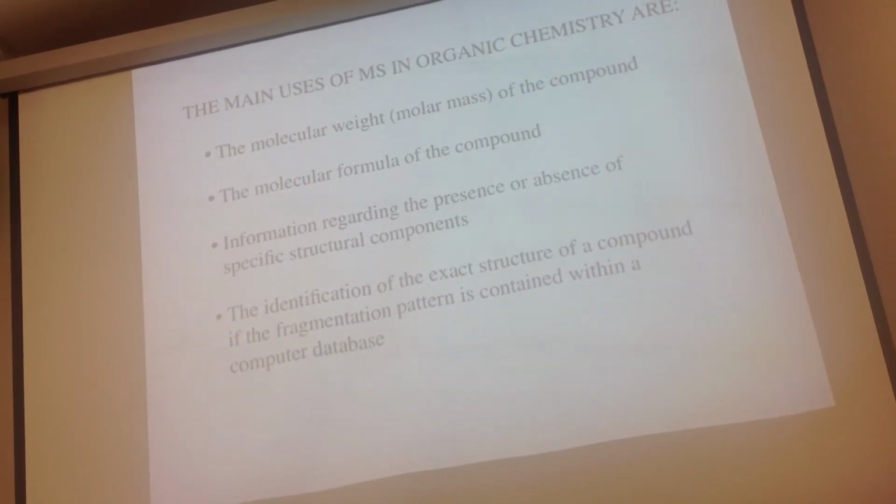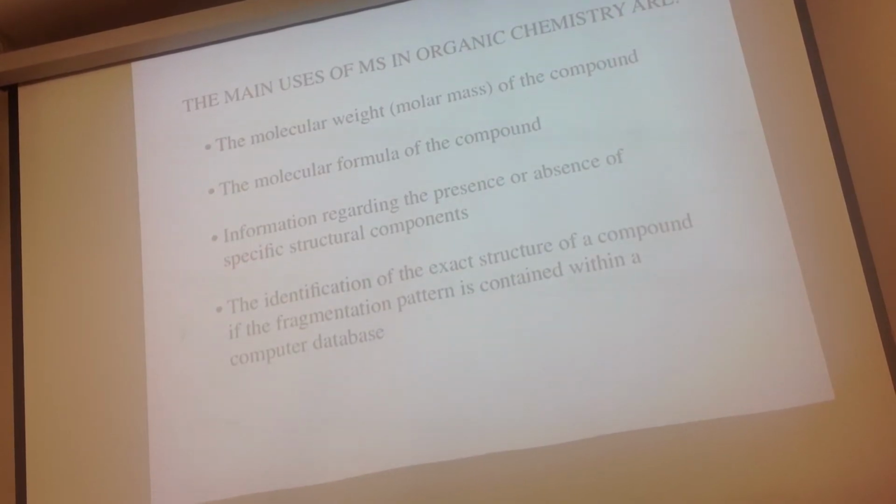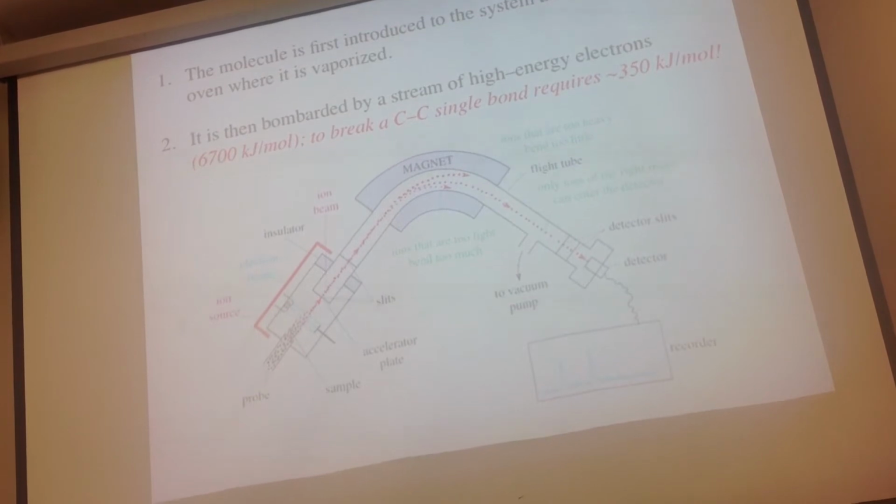So that's how those are used in industry: they tie to a computer database. All right, so let's take a look at what goes on in the actual instrument. We've got a schematic, and we're going to follow through from start to finish what's happening to this poor molecule. Are these machines expensive? Yes, they are. We don't have one.